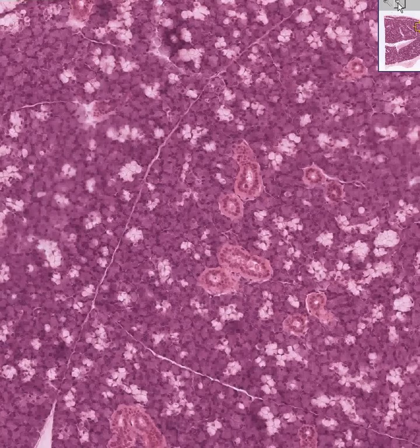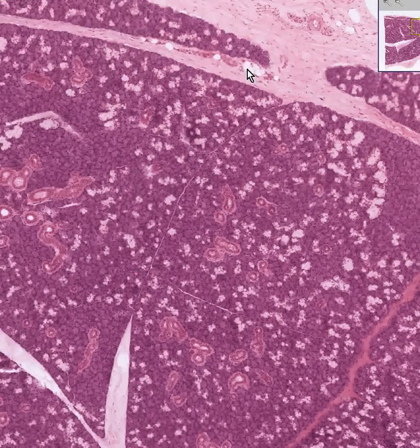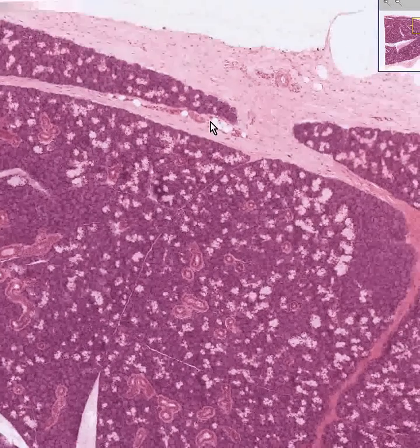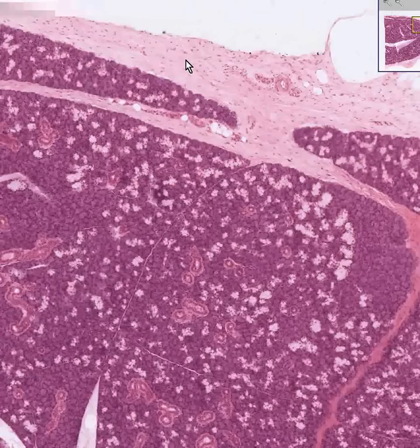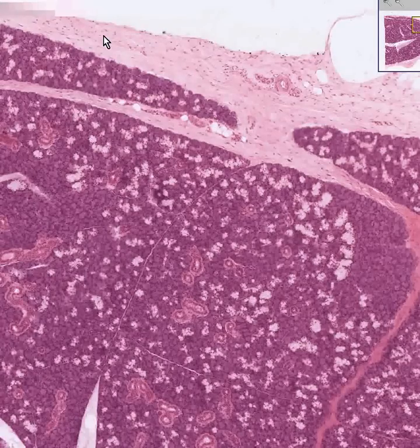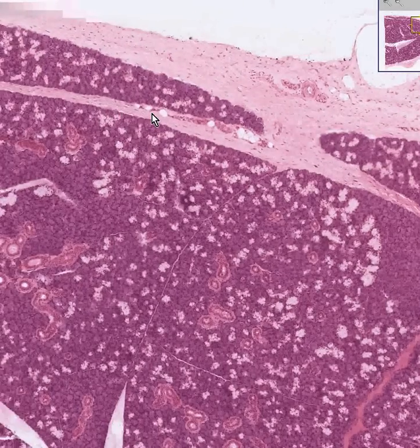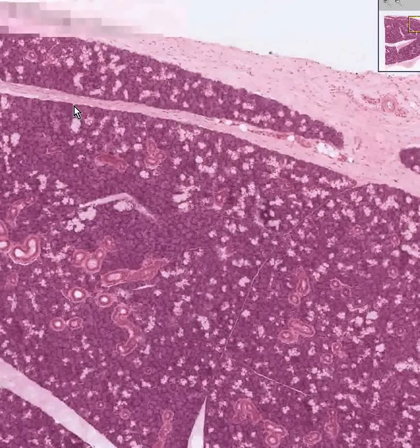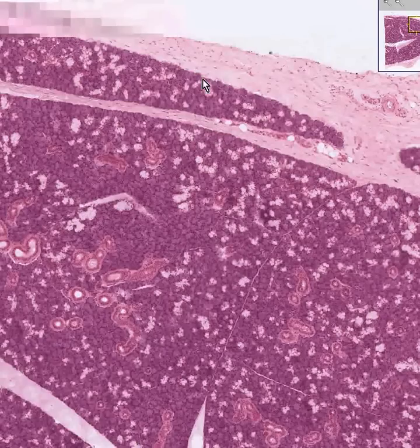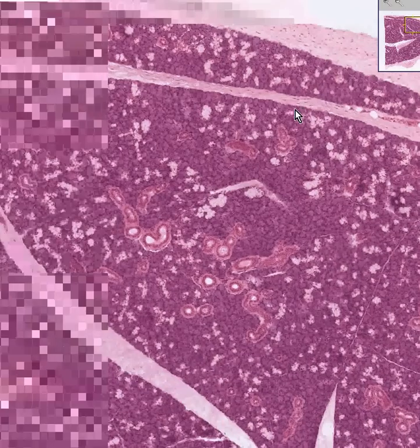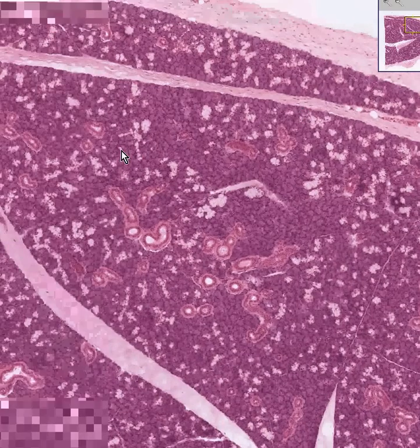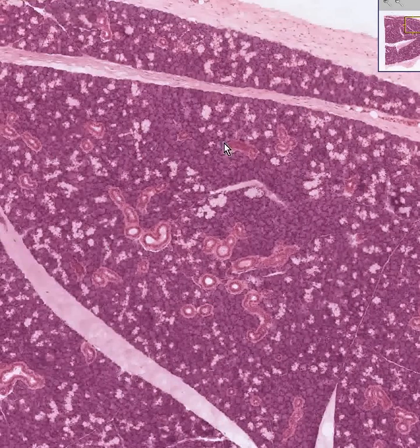Let's go back out and once again describe the classical histo-architecture of a salivary gland or exocrine gland in general. You have a capsule, you have bands of fibrous tissue septae consisting of spindly fibroblasts and collagen, separating and isolating the actual lobules.